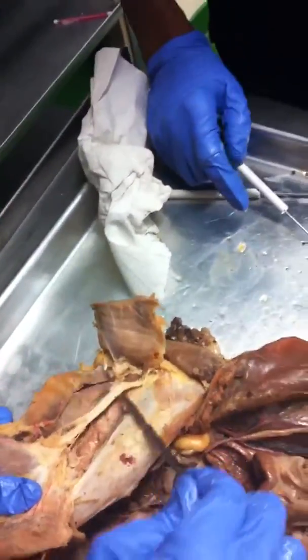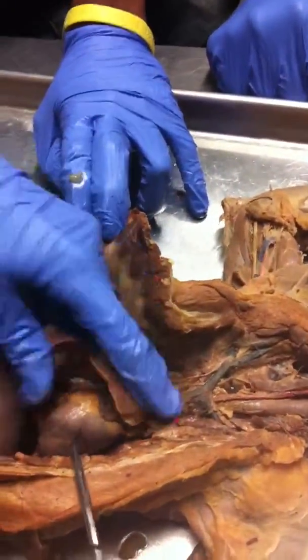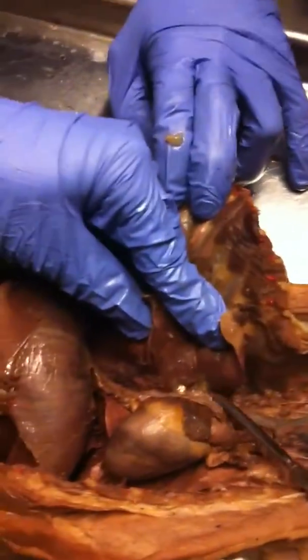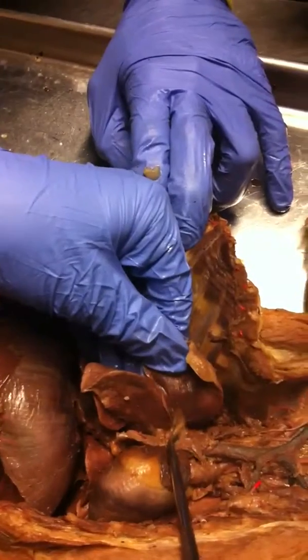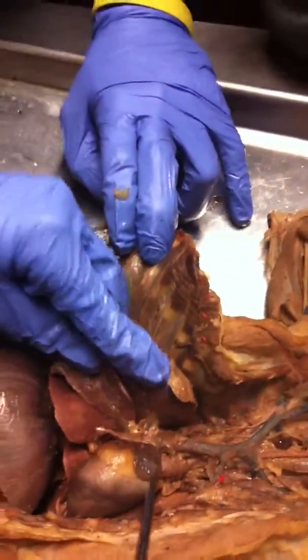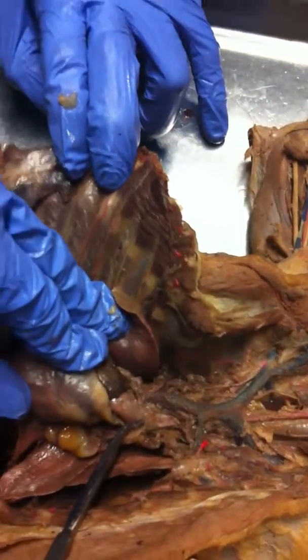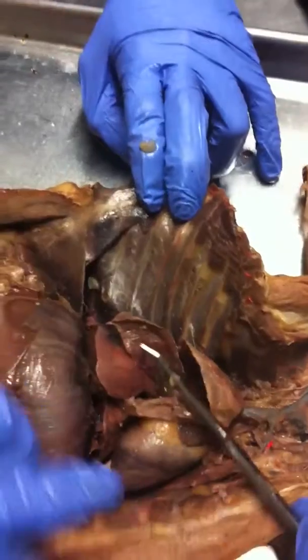All right. Pulmonary artery. Can we see that one? Well, here's the lungs. There's 3 lobes of the lung, and there looks like some veins, I guess, and there looks like there's a little artery that's going into the lungs there. Okay. Aorta would be right here, coming out of the left ventricle. Okay. Pericardium. We can see it on this one, right? Here. This is the pericardium that surrounds the heart. And we have it dissected away.